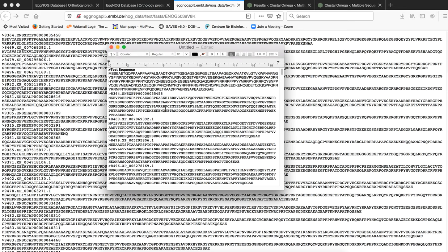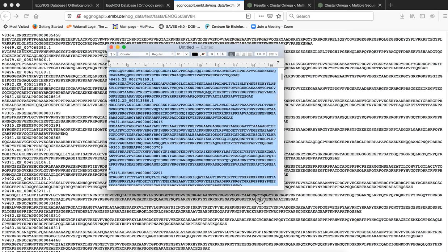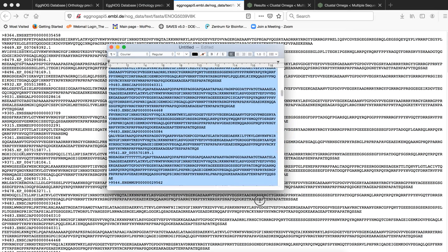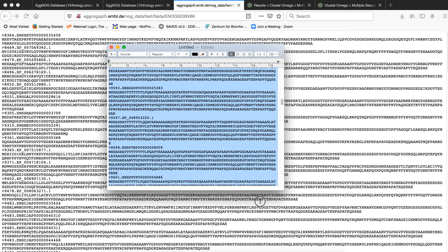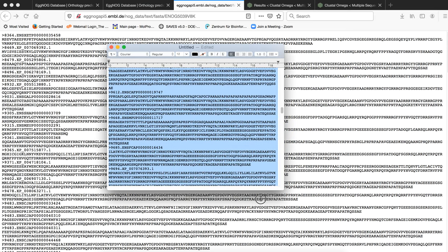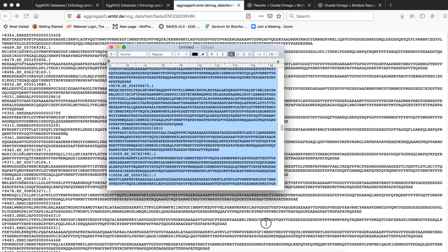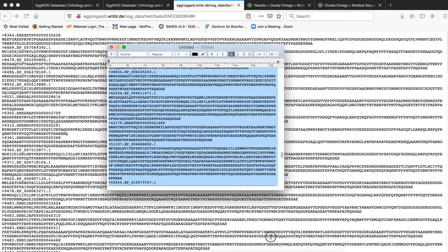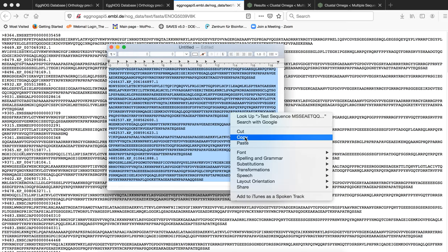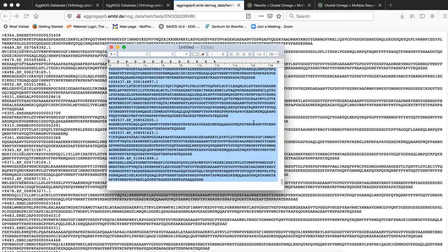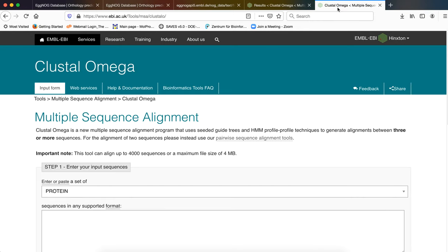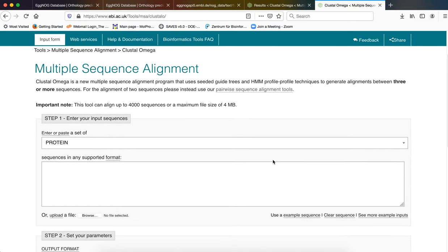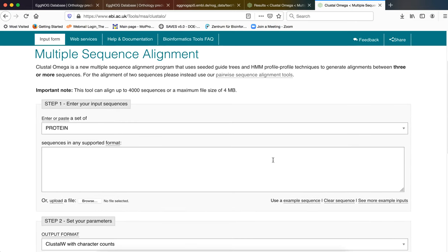How we will generate the phylogenetic tree? We will copy all these sequences. We will copy all the sequences that are here in this file. And we will go to an online tool which is known as Clustal Omega. This is a tool for generating multiple sequence alignment and phylogenetic tree.